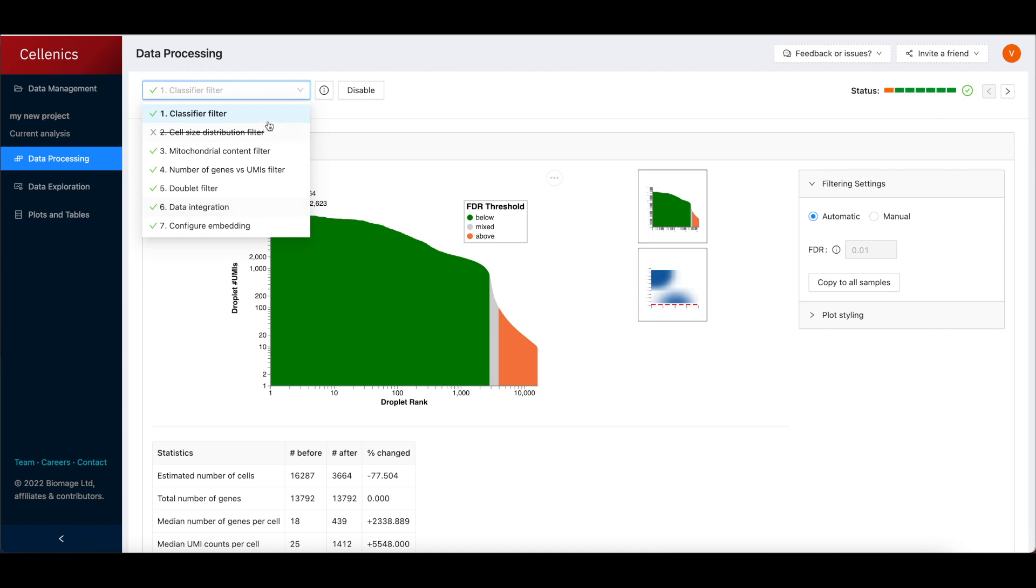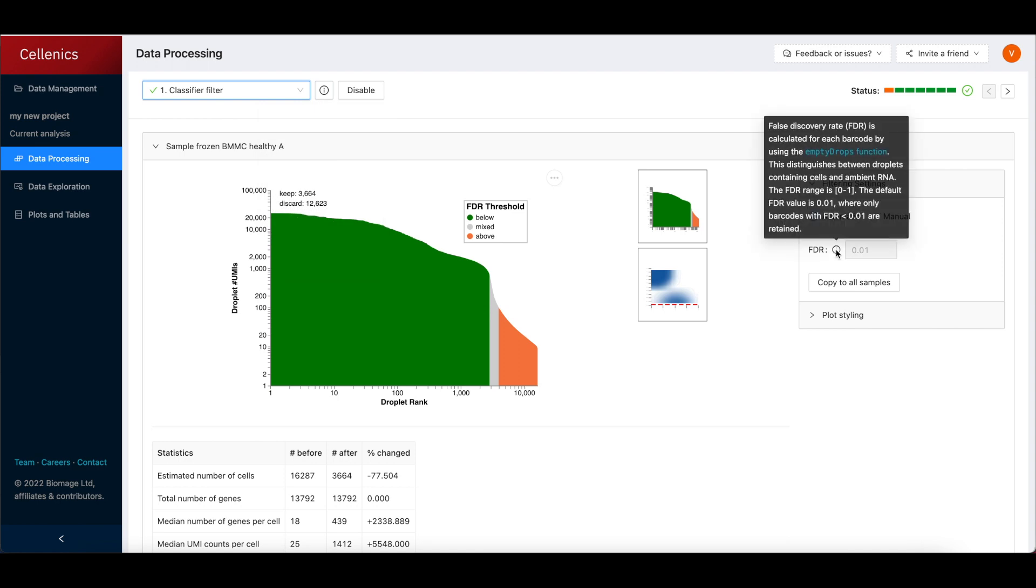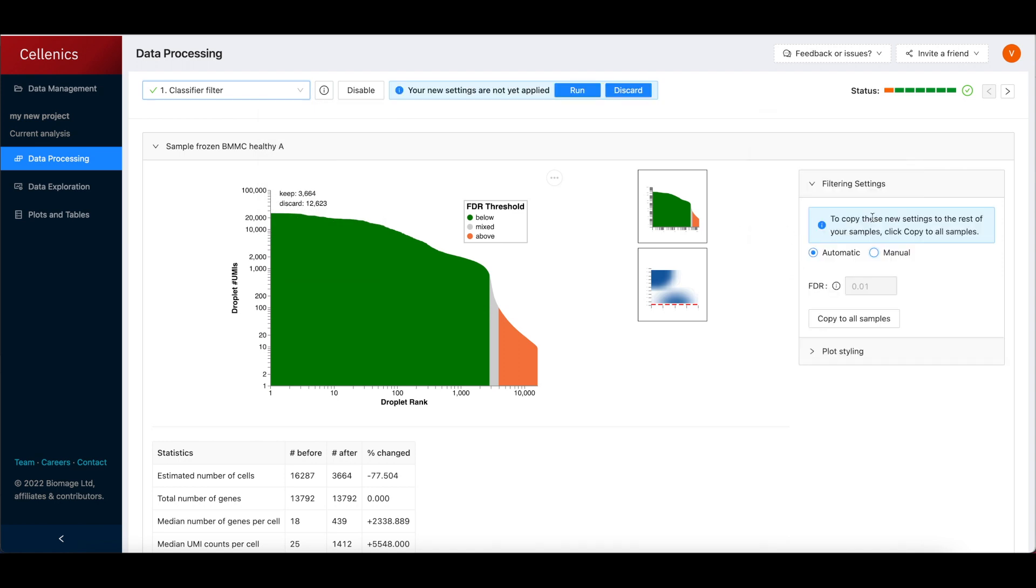At each step, information is available via the tooltips to describe the method and default calculation. To override any of the default settings, simply select Manual and adjust a parameter in the filtering settings, then click Run to rerun the pipeline with the new settings.